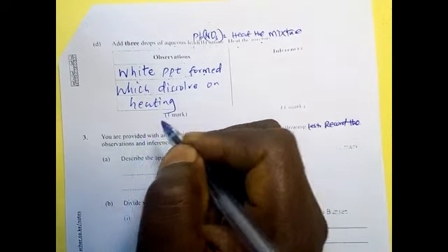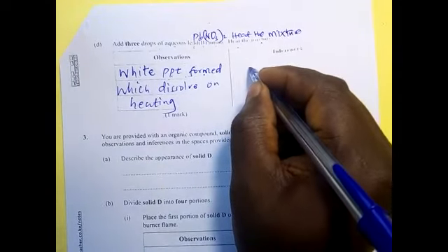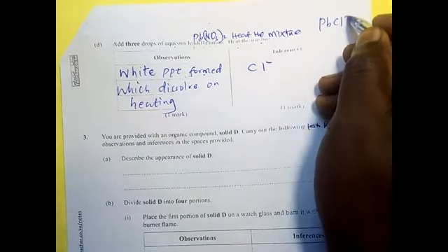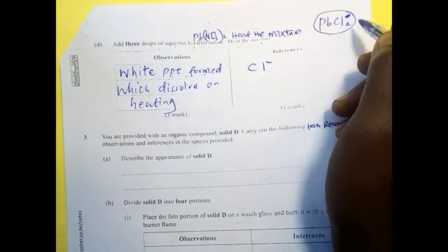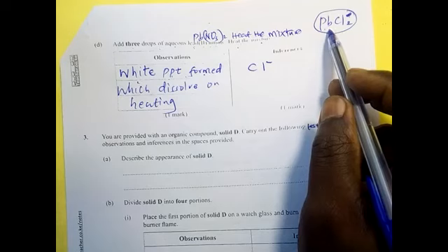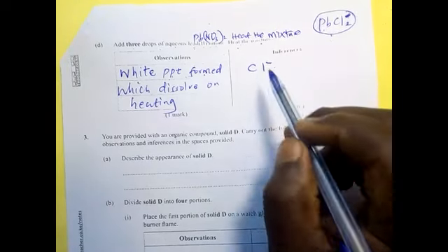So that tells you, if you are adding this, then it means a chloride was there. A chloride, so that it forms lead chloride. Lead chloride is the only salt which forms a white precipitate, and when warmed or heated, it dissolves to form a colorless solution. But is it only chloride?